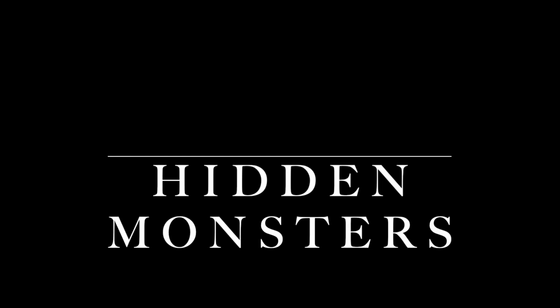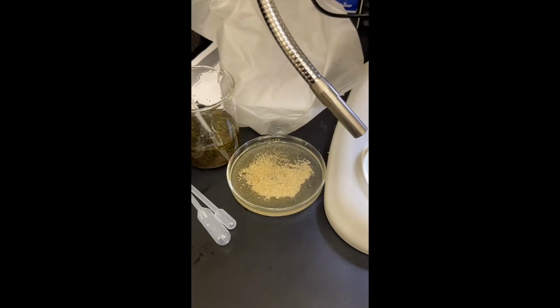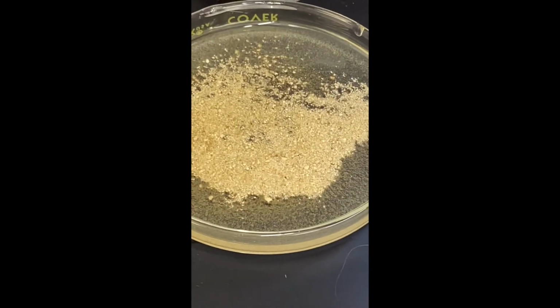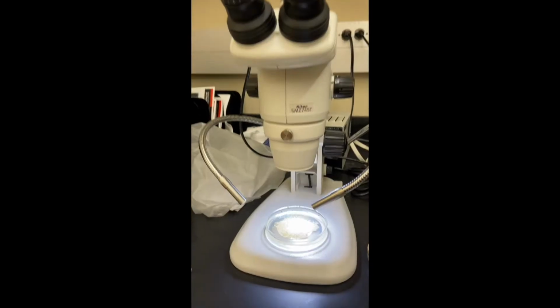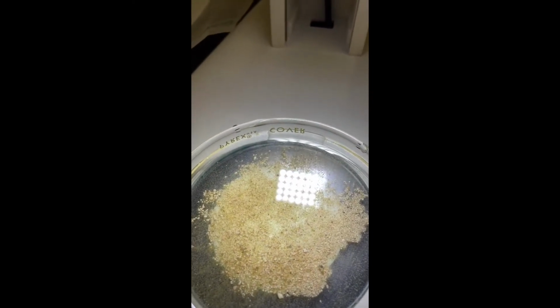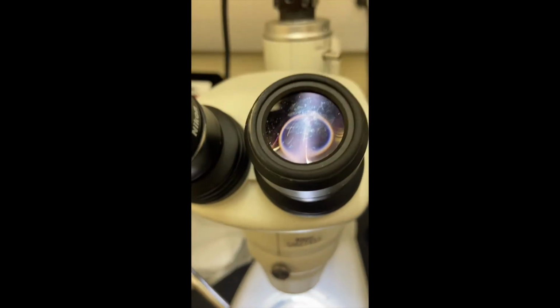Did you know that there's an entire world living in the soil, in the moss on trees, in the sand on the beach, and even in aquariums you might have at home? Let's take a look at some sand under a microscope to see. These hidden monsters are kinds of animals that we call meiofauna.